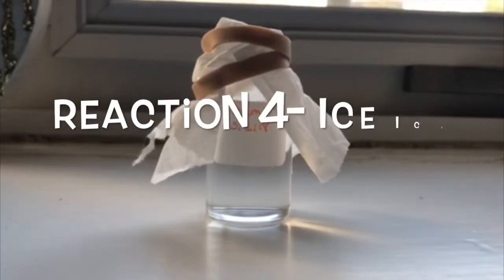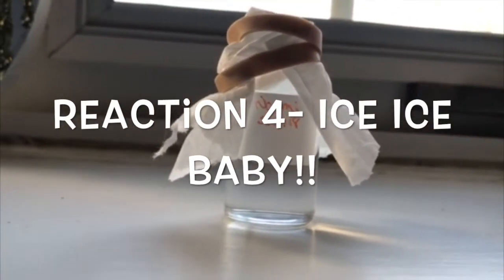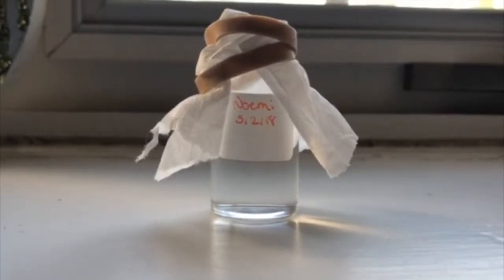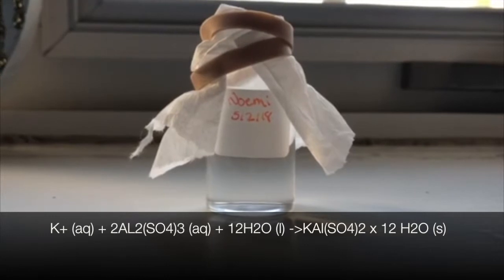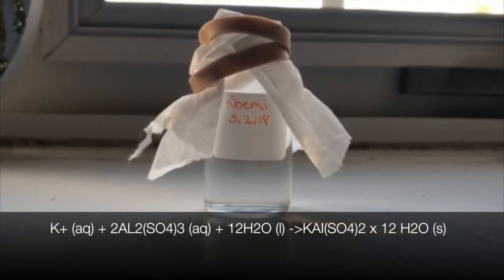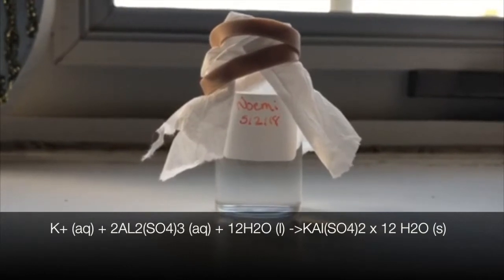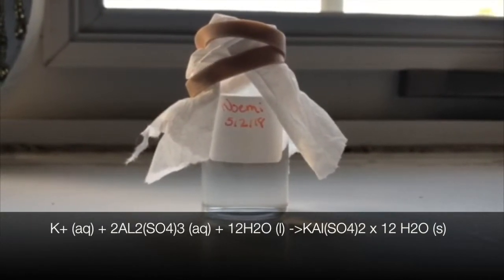Then, finally, for the fourth reaction, we cooled the solution by placing it into an ice bath, which led to the following reaction. An ice bath was used to precipitate crystalline alum from the solution. Alum is insoluble at lower temperatures, so when the temperature drops close to freezing, it will fall out of the solution until there is no more alum left in the solution.